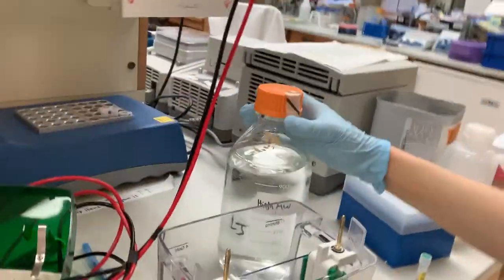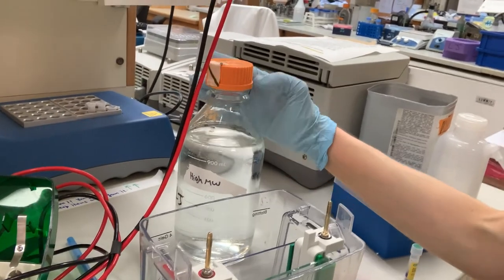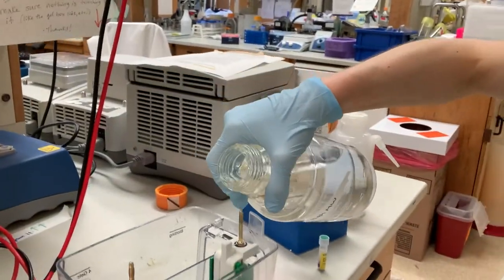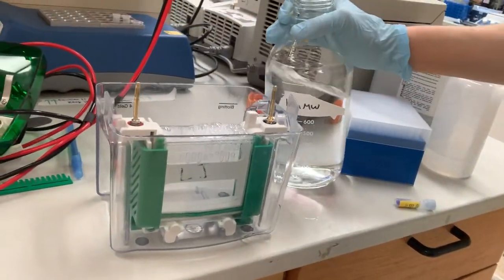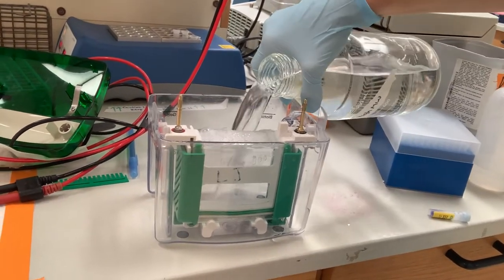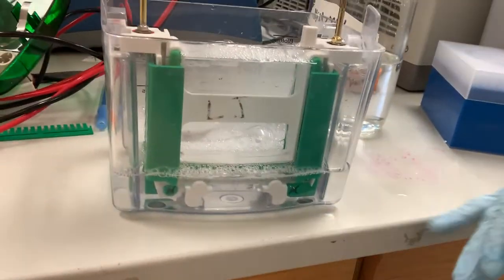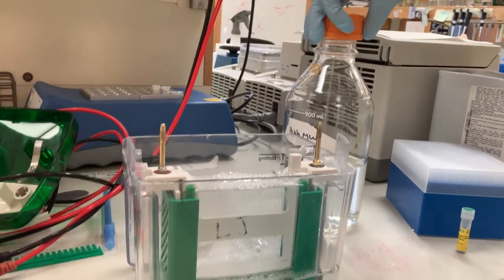In our lab we make our own buffers — we have a high molecular weight buffer and a low molecular weight buffer for this NuPAGE system, and also a different buffer for Tris-glycine gels. I normally start by filling the buffer dam side first to make sure it doesn't leak, then keep pouring. You want to make sure you cover the bottom of the gel.